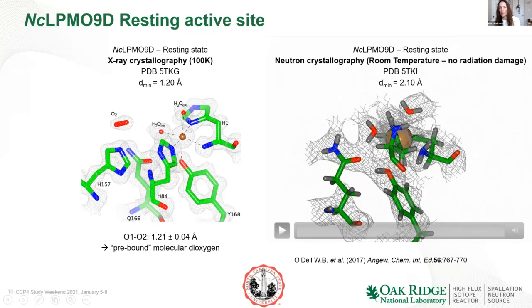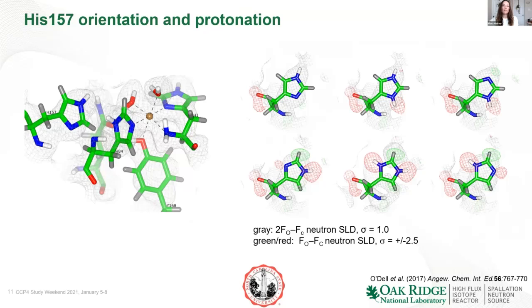So this crystal was a hydrogenated protein exchanged to D2O. So you can see that the density is fairly clear for the deuterium atom, but wherever we have hydrogen, like here we have a CH2 group, we have this cancellation that I mentioned. So again, we see deuterium much better than we see hydrogen at the typical resolution that we can achieve for protein crystallography.